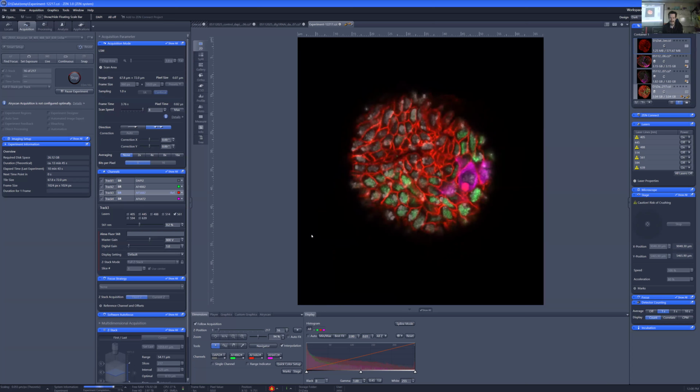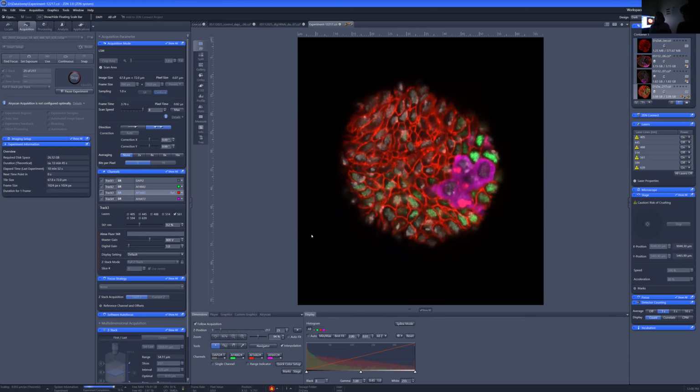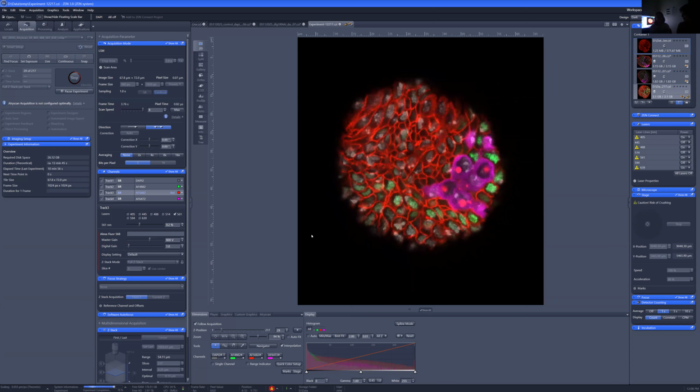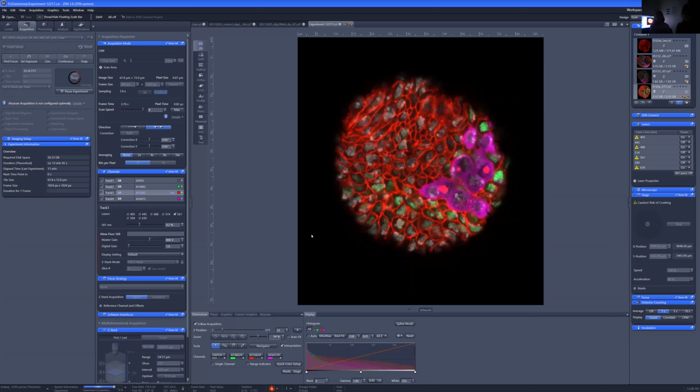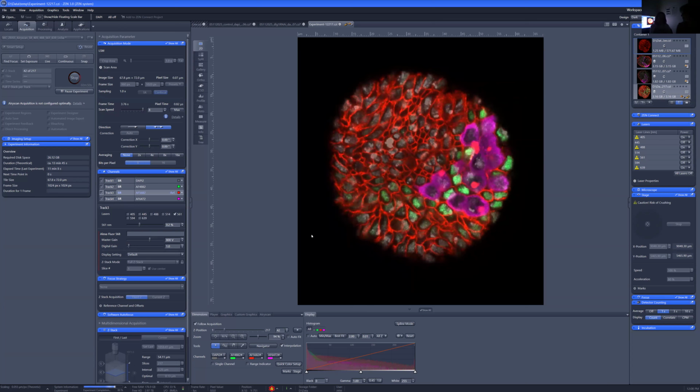I had to fix all of these problems, and it was frustrating because I would fix one and the problem wouldn't go away, so I didn't know what was happening. I just kept trying different possibilities until I hit upon one that worked, and then worked backwards and realized, oh, it must have been the slide, and the sample, and the temperature. So it was a whole thing.